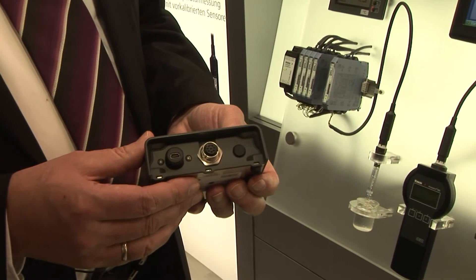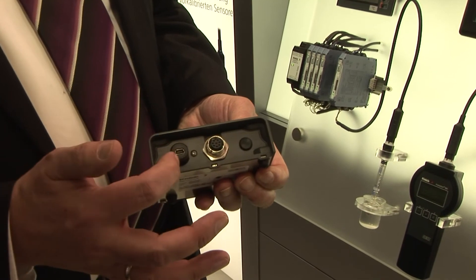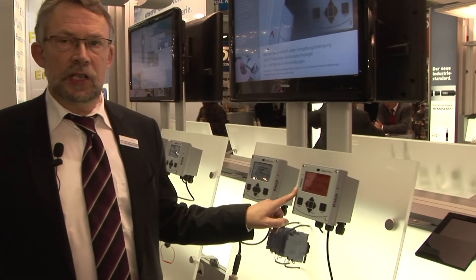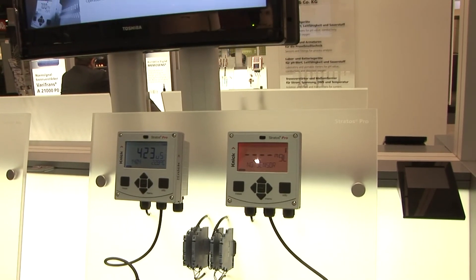The USB MemoSuite link uses an M12 worldwide standardized plug-in for the sensor, and on the other side a micro USB for quick reconnecting to the PC. Stratos Pro — worldwide unit process analyzer, loop-powered two-wire system, full explosion proof, unique backlighted colored display. So if you reconnect the sensor, the warning display red will change to green.